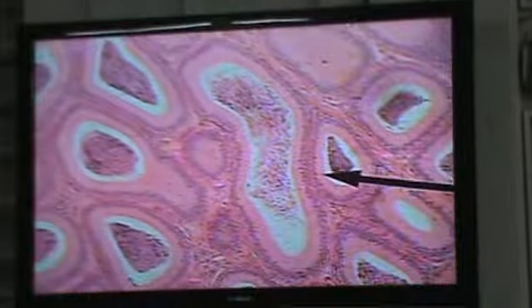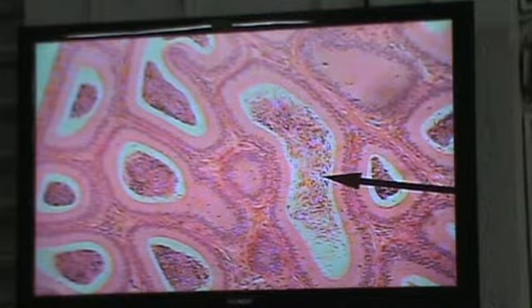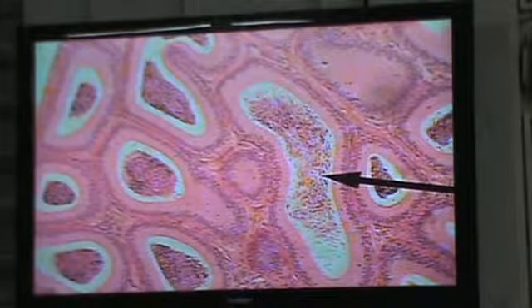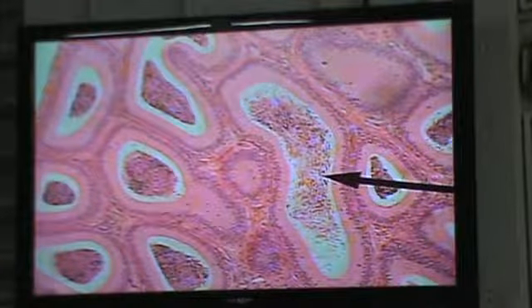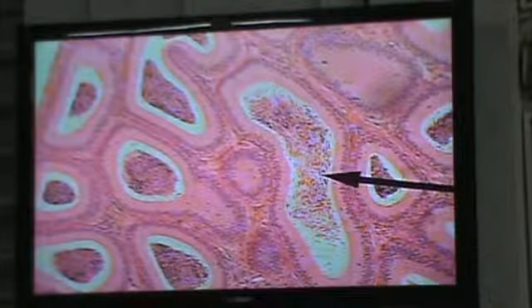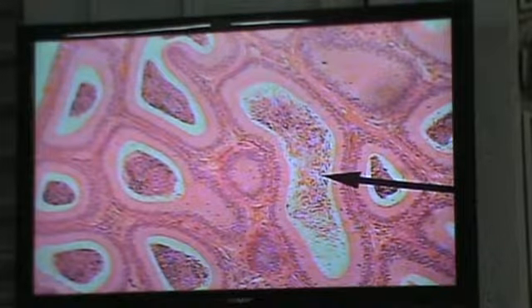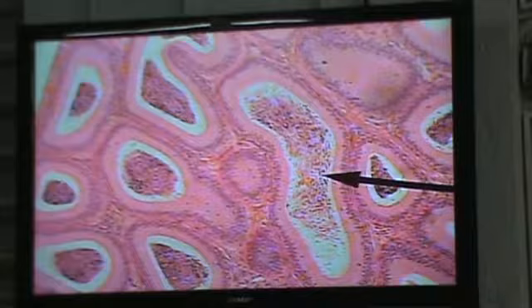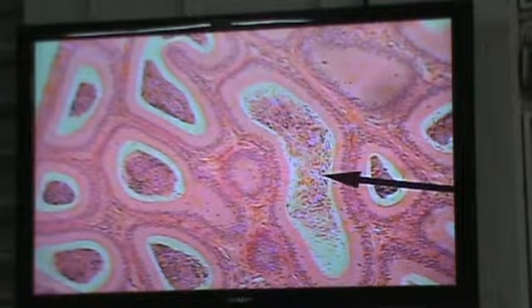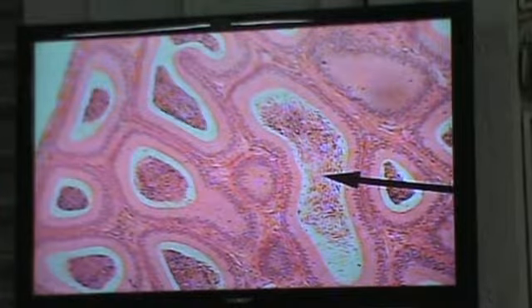Alright, because we see the area that the sperm are stored in. Okay, so the spermatozoa, they camp out, just like soldiers, until called into action. They're very dangerous fellas, don't fool with them. And there they are quietly camping out in the what? The epididymis. Okay? So there you can see the epididymis. So where you see sperm stored, then you know that we're looking at the epididymis.